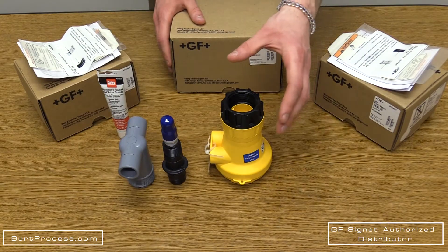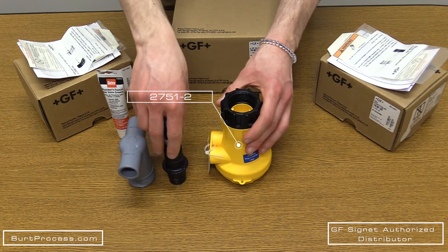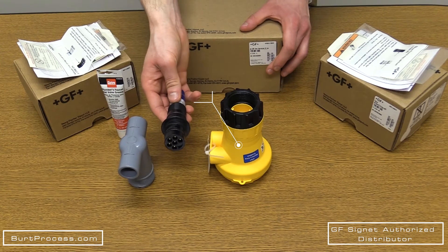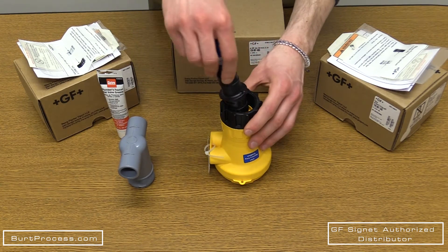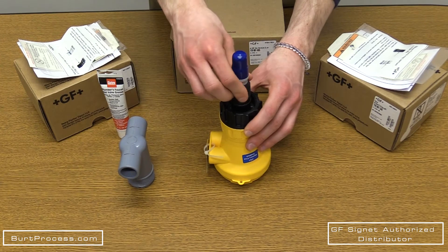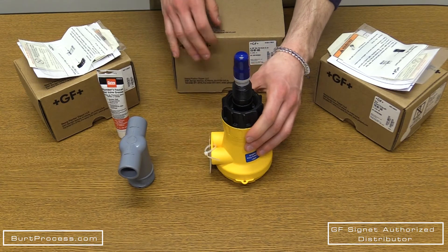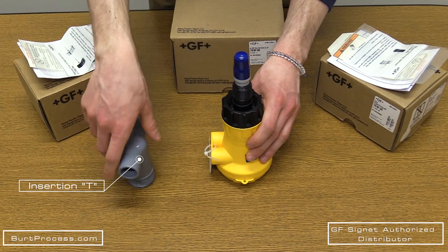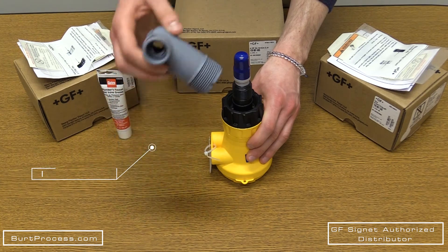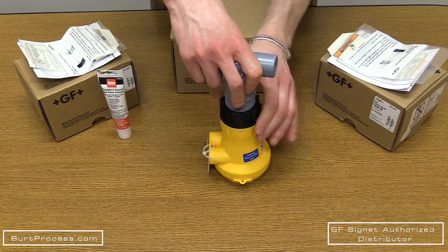Alternatively, for inline applications using the 2751-2, take your flat style pH electrode and place a small amount of lubricant along the O-ring. Seat it into the preamp, locking it into place. Note: remove the cap prior to installation. Then take your insertion tee, place it over the top, and reverse thread the locking nut.